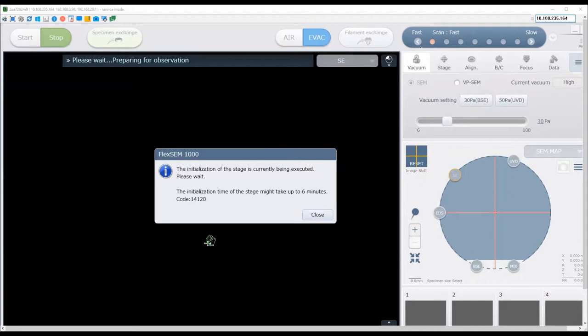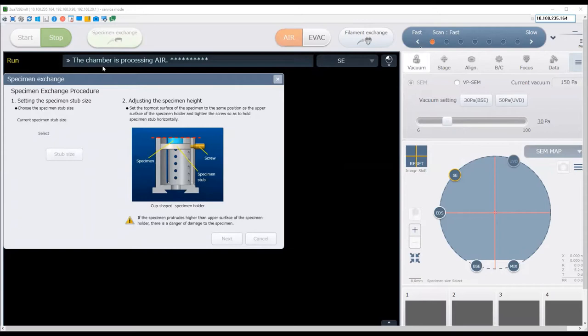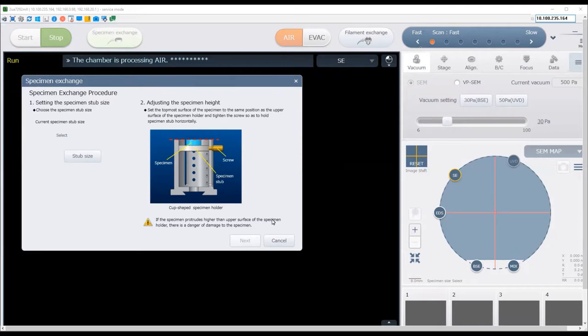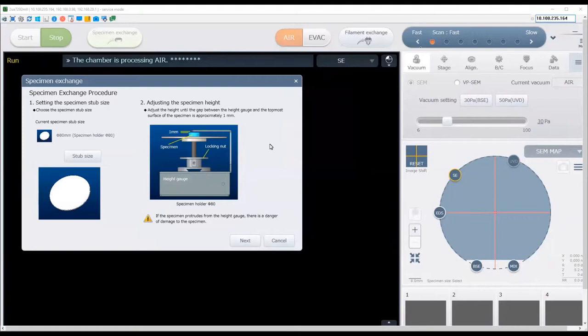Once this dialog disappears, press specimen exchange. The software will indicate that the chamber is processing air, which means it is venting the system to allow you to put a sample in. It will bring up the specimen exchange procedure for you to follow. The first thing to set is the specimen stub size — click stub size and select the top one, 80 millimeter. This is the largest holder we have and therefore the safest setting for the software. Click OK.